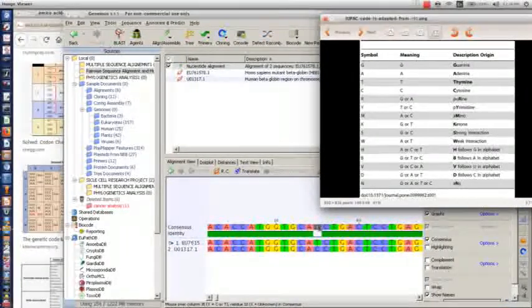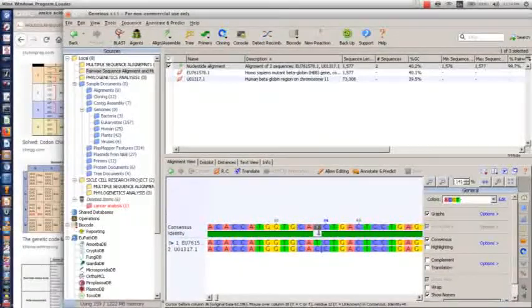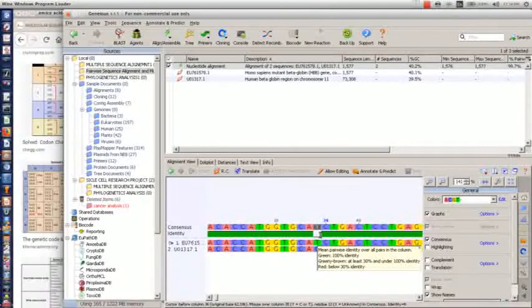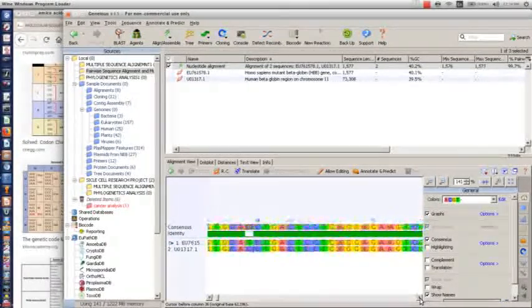Another thing you need to understand in this mutation analysis is that each of these mutations that took place actually has a resultant effect on the amino acids. Are you getting it now? We're going to work on that, but let's first understand the mutation that took place in the nucleotide. We are done with that. Let's move on to the other mutations.